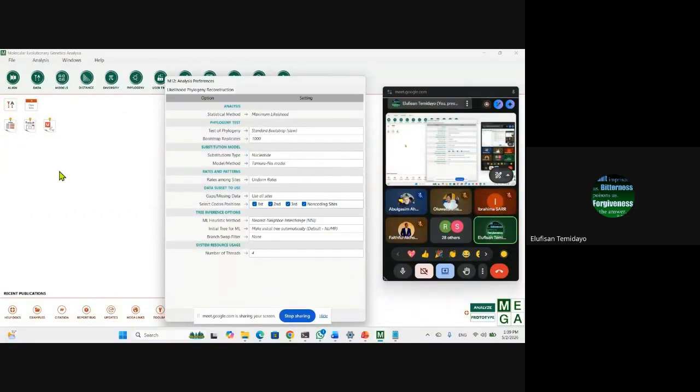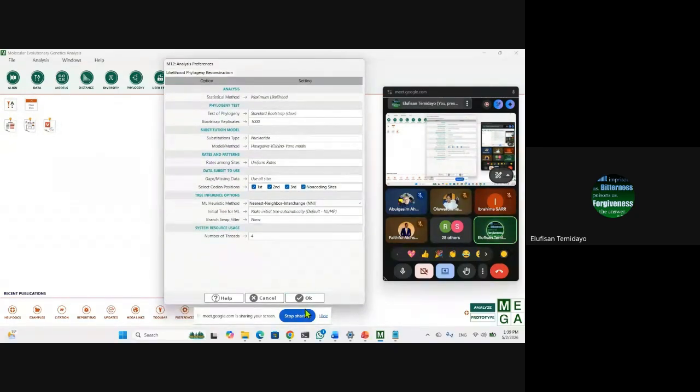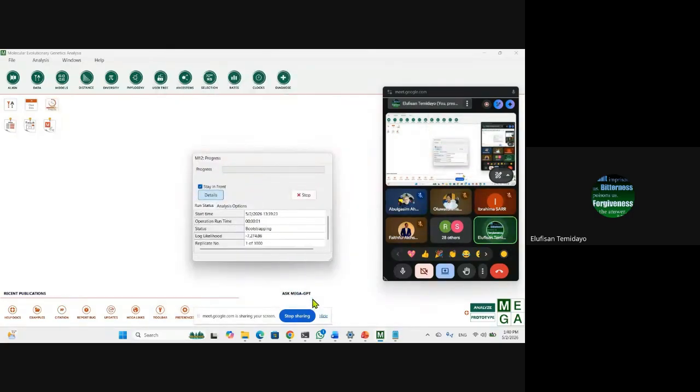Now, in the models that we have, I don't think we have Tamura. Do we have Tamura in our model? If you remember that model, we have this one. This is the best one that they told us, and that's what we are working with, based on our sequence. I checked it from here, and it gave a list of the models we can work with, and the best is this one, the one that's number one. So then what do we now do? The next thing we do is, okay, this one. So now we are working with it.